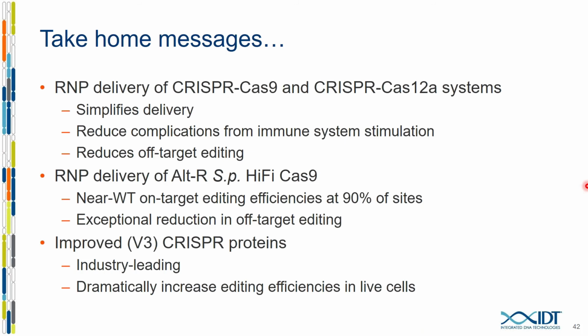Great, thank you. Liam would like to know if the RNP system is effective for modifying bacterial genomes. Yeah, so the answer to that question is I don't know. I do know that bacteria have extremely powerful 3' to 5' exonucleases, and I also know that it's not a super common thing to try and deliver protein directly into bacteria via electroporation or chemical methods.